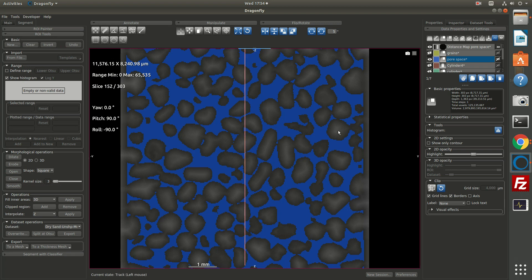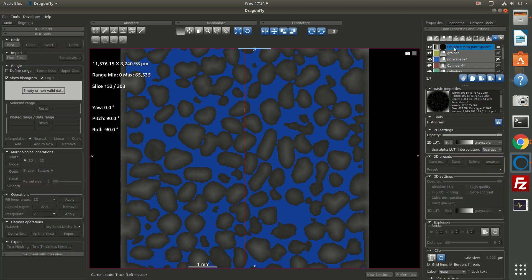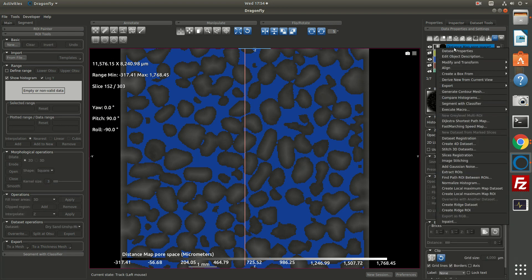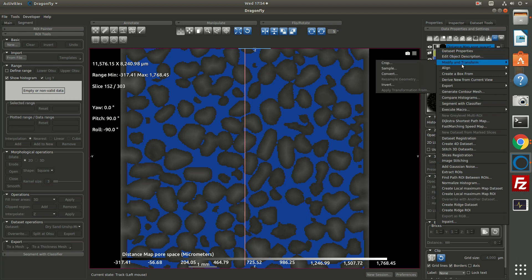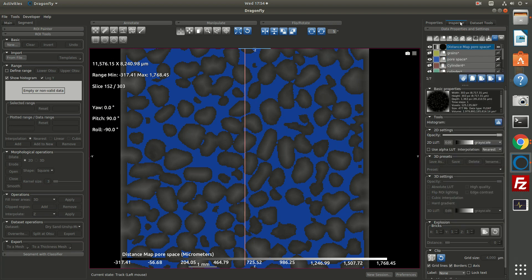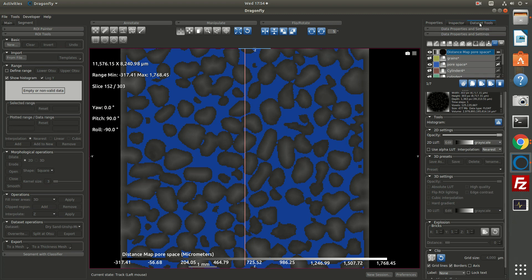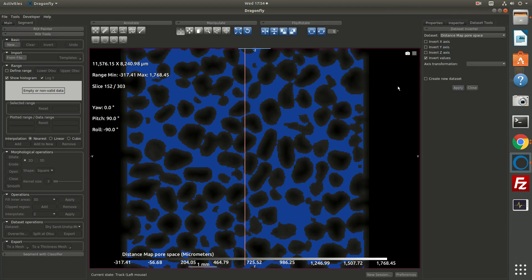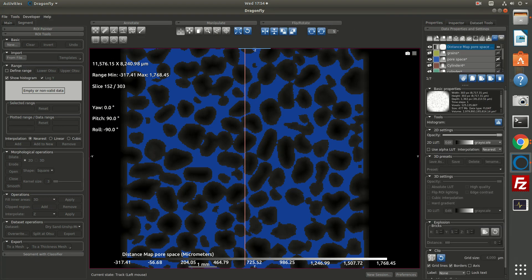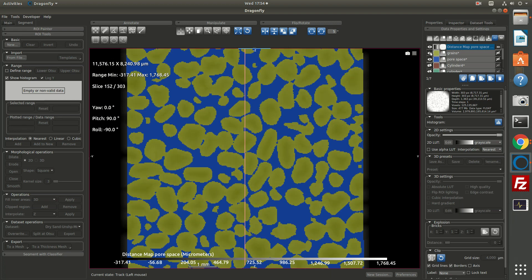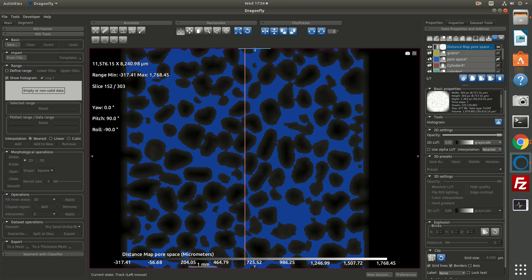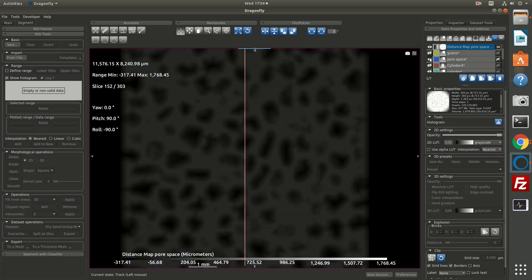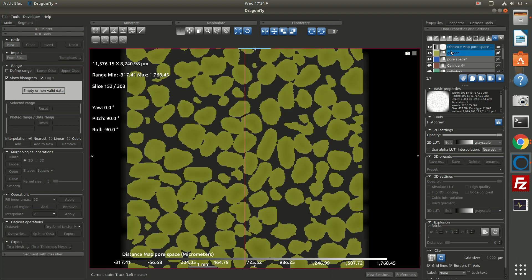Now for this sort of operation where we would like to perform a watershed on the distance map, we actually need to invert the distance map. So I'll right click the distance map and choose modify and transform invert. This gives me the data set tools panel, in which case I'll choose invert values and I'll deselect create a new data set. The result is now the image is inverted. I'll go back to the main tab. So we have our grains ROI, our pore space ROI, and this inverted distance map.